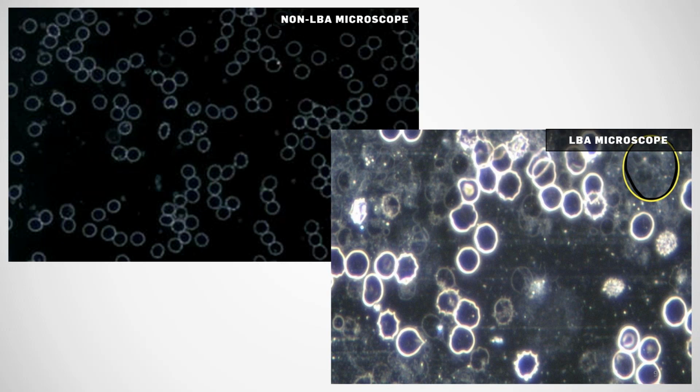But even microscope cameras specifically built for microscopes also need to be checked because of the different lighting conditions in bright field versus dark field. The exposure levels need to change quite drastically to produce a good quality image. So that's also important to check, whether the camera would be able to handle that. Right.